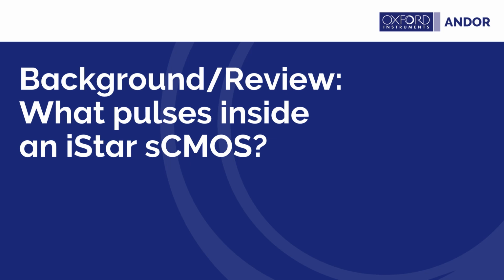So before I get into a few real-world examples of how the iStar sCMOS can be used with the different types of instruments that I've just been talking about, I want to do a brief background review of the internal components of the iStar sCMOS so that everyone remembers how this camera functions.